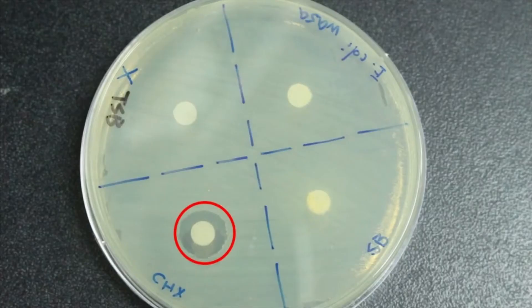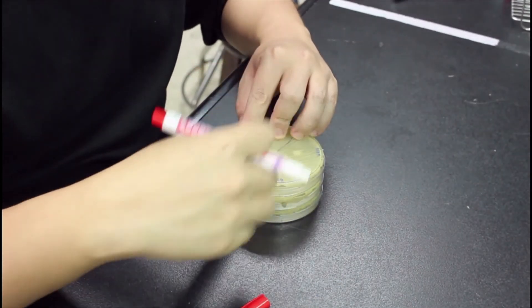Now after 24 hours of incubation, you can see the inhibition zone, which is the transparent area on the plate. What I'm going to do now is to measure it.